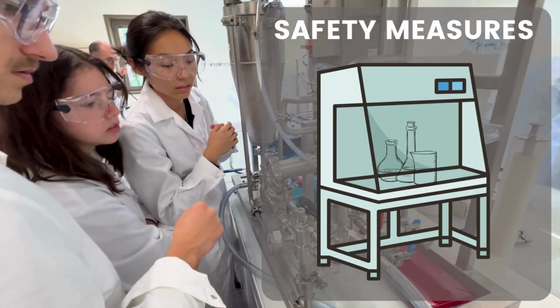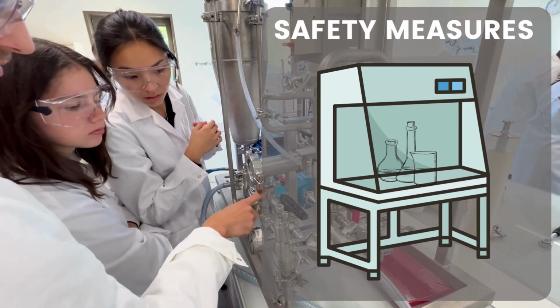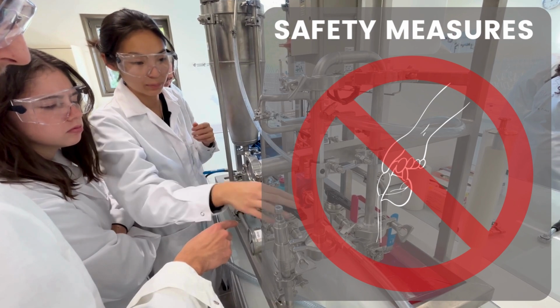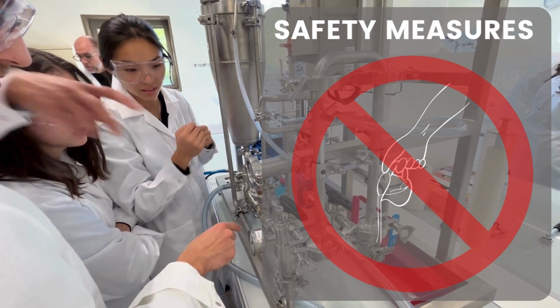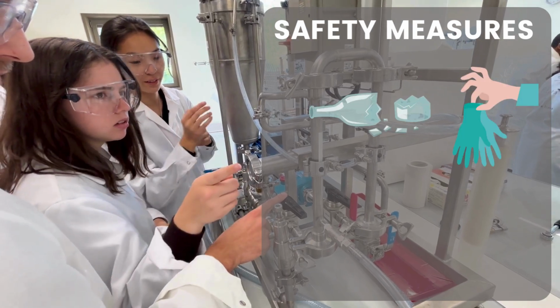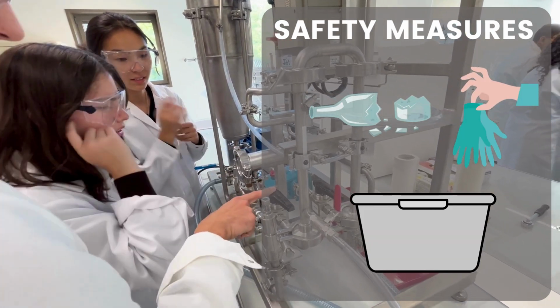There are pictograms on all bottles indicating risk and safety. Do not pour any solution with a pictogram down the sink. Instead, use the marked recovery cans for solvents and aqueous solutions. Broken glass and used gloves should be disposed of in the designated box.